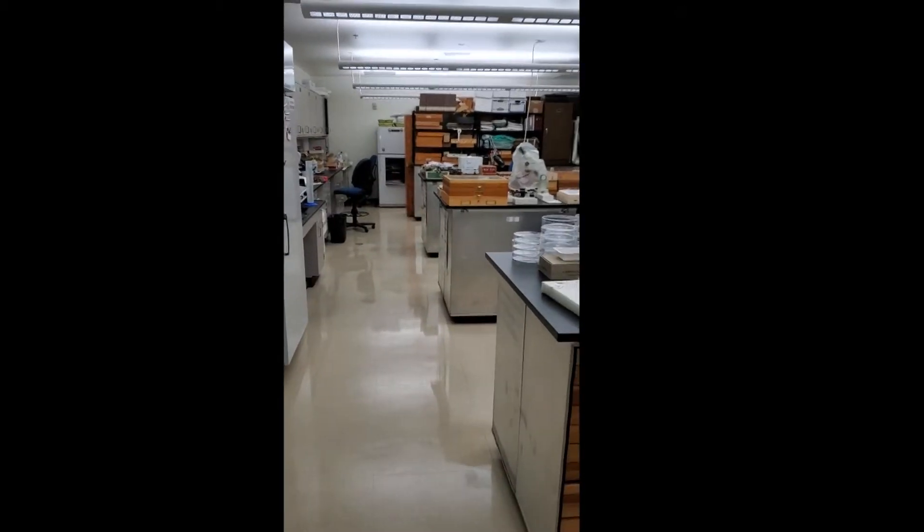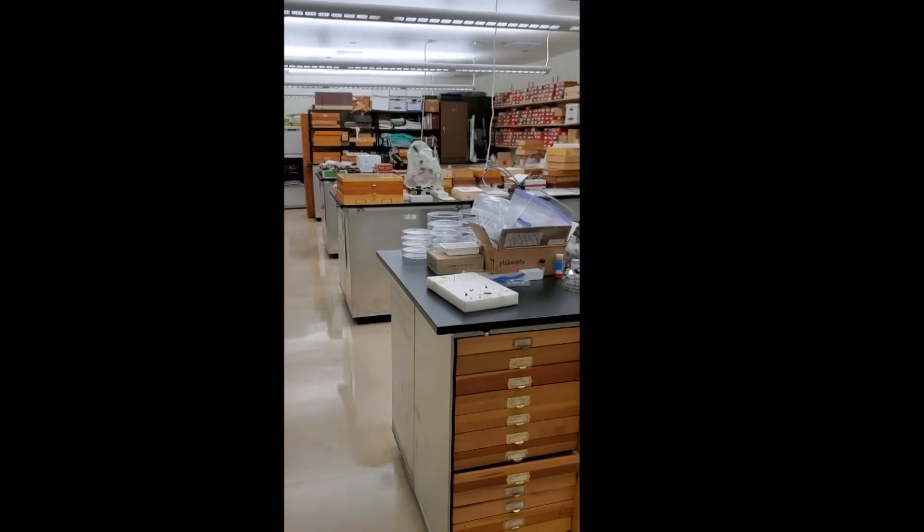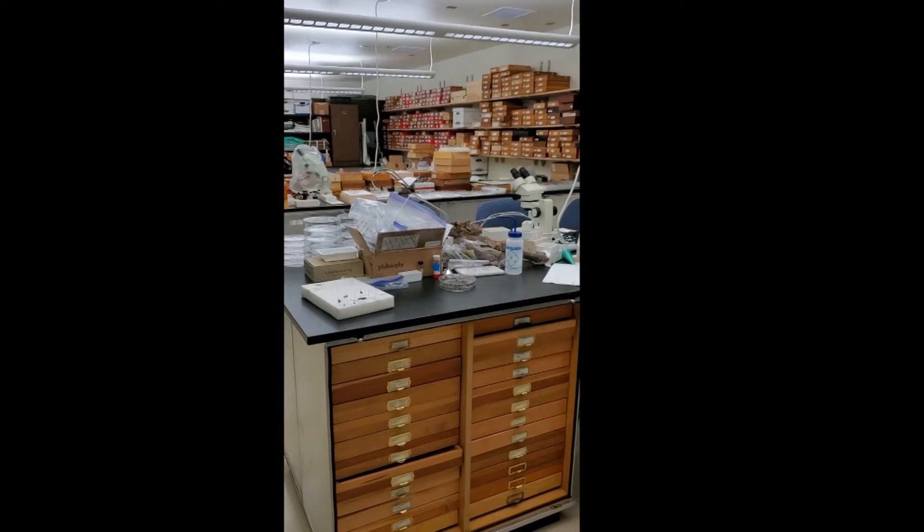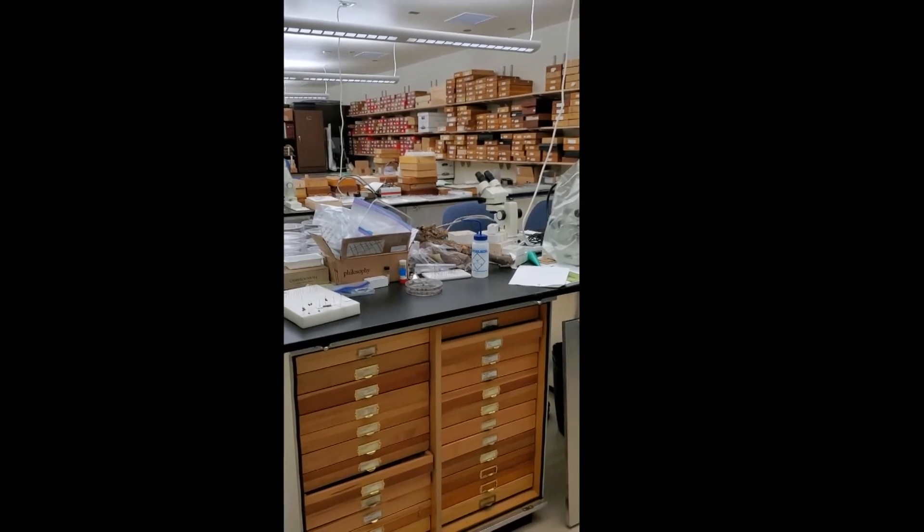This is the insect reference collection for the state of Nevada. We have over 300,000 identified insect specimens in the collection. The boxes on the wall contain specimens that have yet to be identified and moved to the collection.